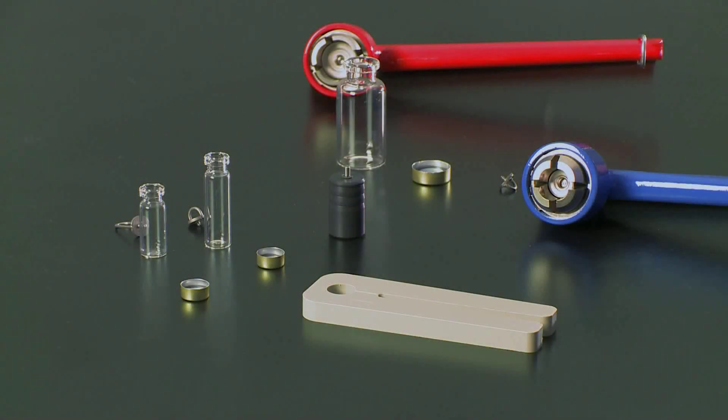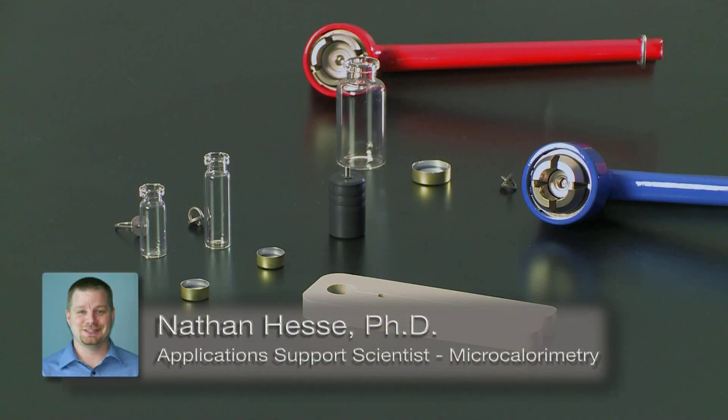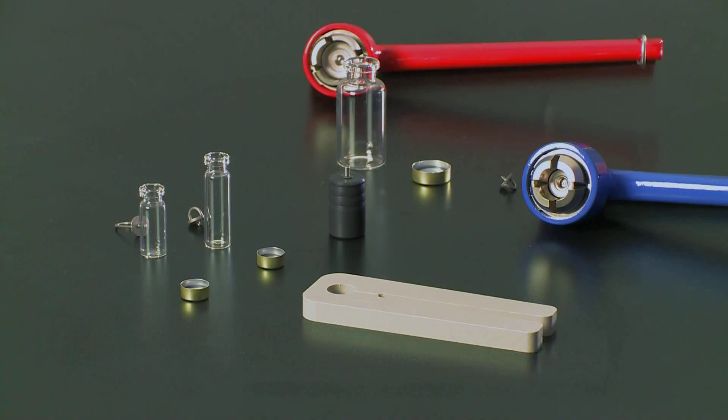In this TA Tech Tip, we're going to be sealing disposable glass ampules for the TAM microcalorimeters. First I'll be showing you how to seal the 3 and 4 milliliter disposable glass ampules for the TAM-3 calorimeter, followed by the 20 milliliter disposable ampule for the TAM-3, which can also be used for the TAM-Air calorimeter. We'll start with the 3 milliliter ampule.